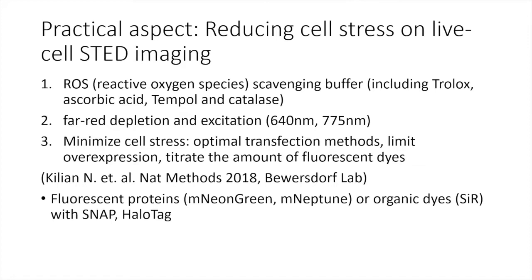You can use a reactive oxygen species scavenging buffer to protect your fluorophore, and use far red depletion excitation to make your cell happy and minimize cell stress. This paper is very useful because they mention different aspects of how to keep your live cells happy for live STED imaging.